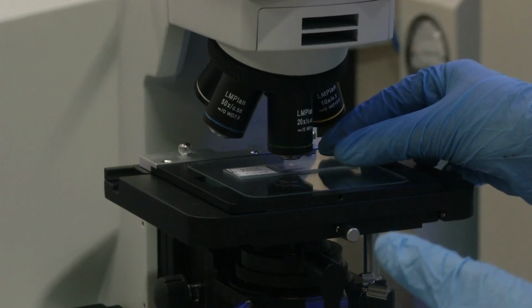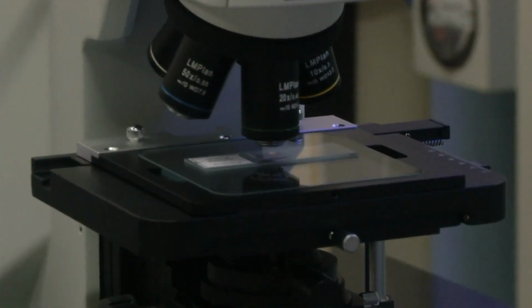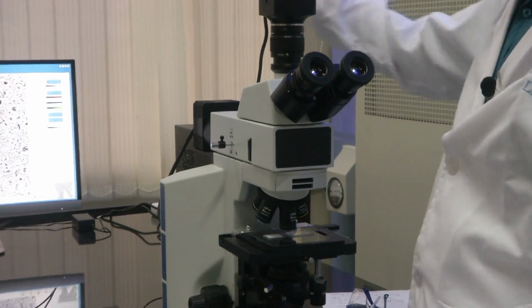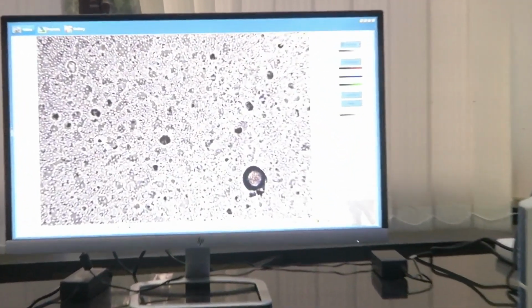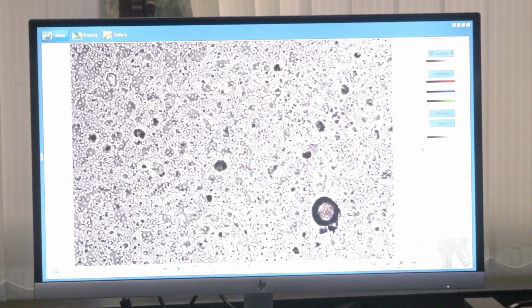Okay. So, now once we put the sample, we have to first see it through the eyepiece. Because we have a camera connected, you can actually see on the screen what we are seeing on the slide. Now, you can look at only the screen as I change the different knobs. Let us say now you can see, right, there are a lot of dots and other bigger pieces. So, this is the malarial parasite slide which we are seeing.